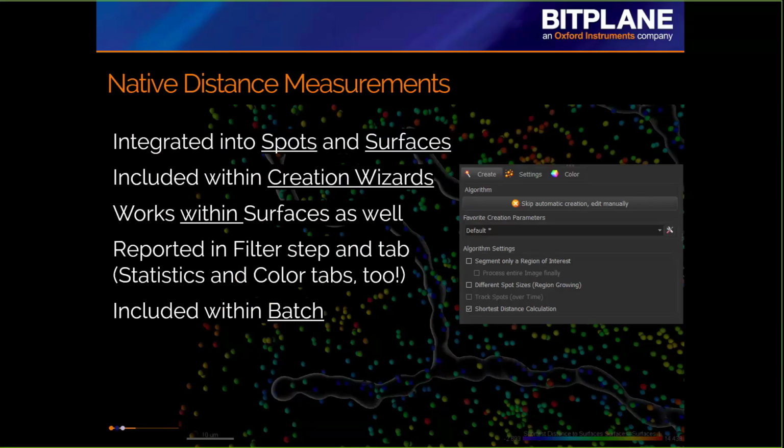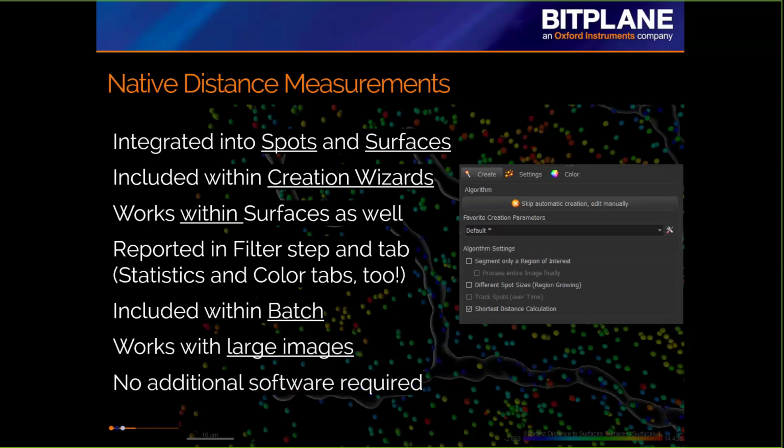As I mentioned before, this feature is included within batch, and it works with large images. And no additional software is required. So no additional widget within Imaris is required. No additional MATLAB widget is required. It's all within Imaris, which makes it much simpler for you to use, and especially for new users of Imaris to begin doing this work.